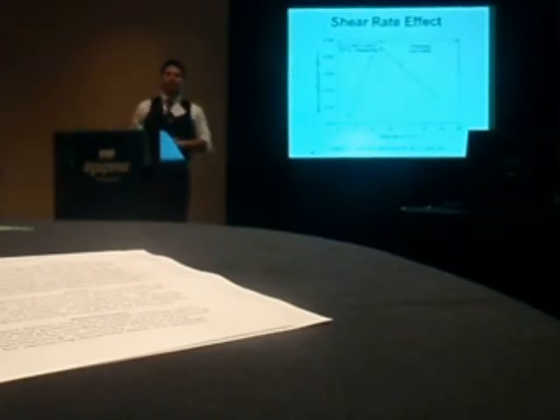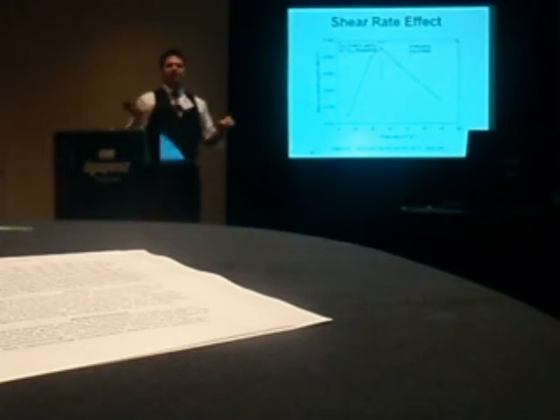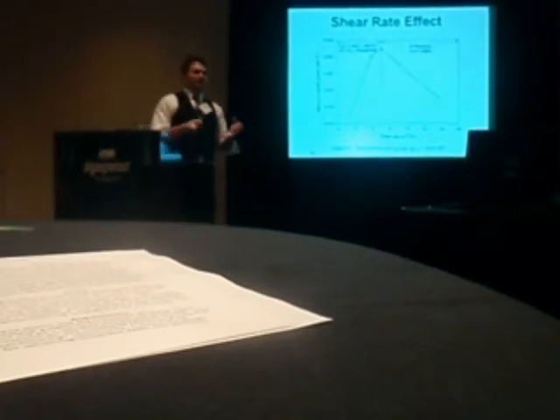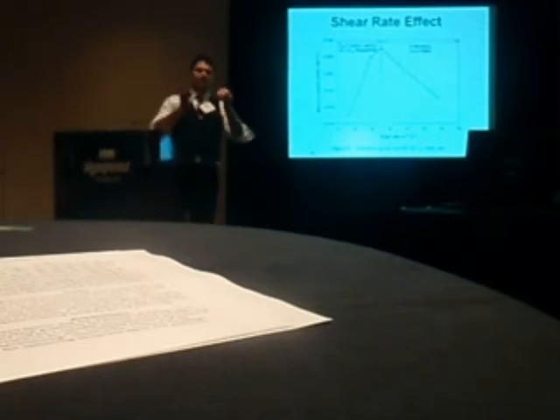Also, the important things to consider are things like shear rates, basically the mechanical forces that act upon your algae cells to break them. Things like this can happen when you have your gas CO2 mixture coming in from your bubble zone. Well, I'm about to present another technique that I think will get you a better shear rate. But you want to try and optimize this so you aren't killing your algae cells with your gas mixture coming in.